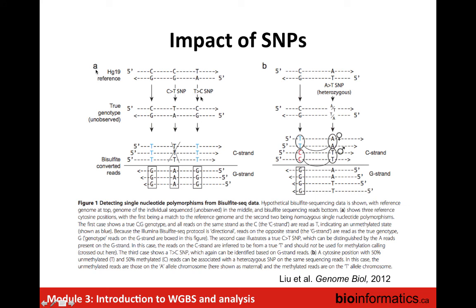Here, this T is actually a C, which in this genome is actually also an unmethylated C in reality, but what you're going to observe is a T. So again, it gets a little bit complicated, so all of these T's are very different T's that you're observing.